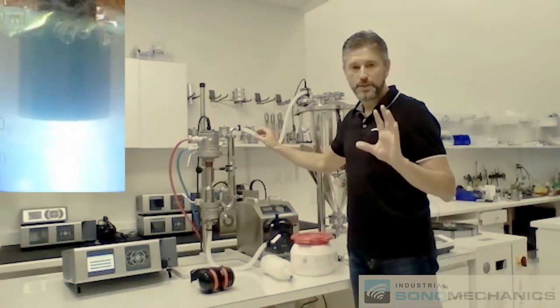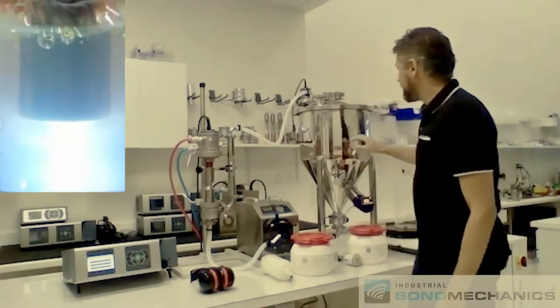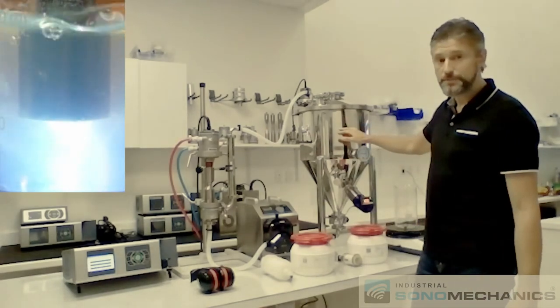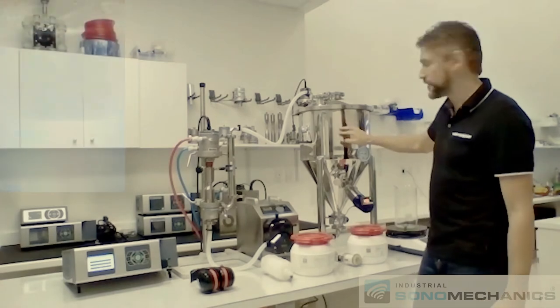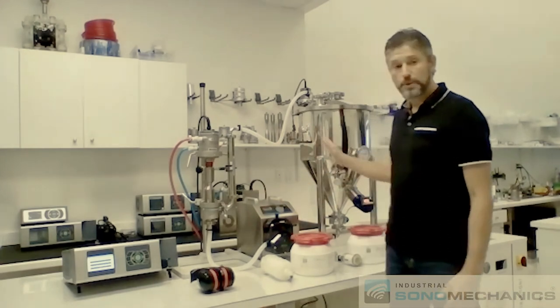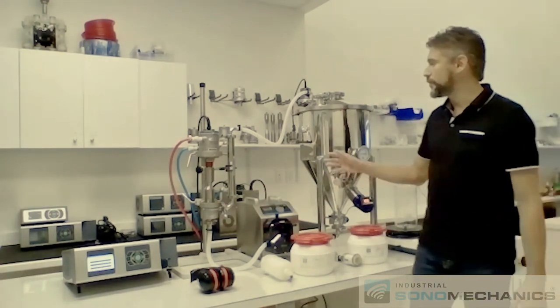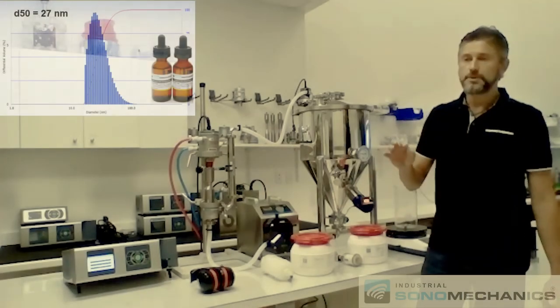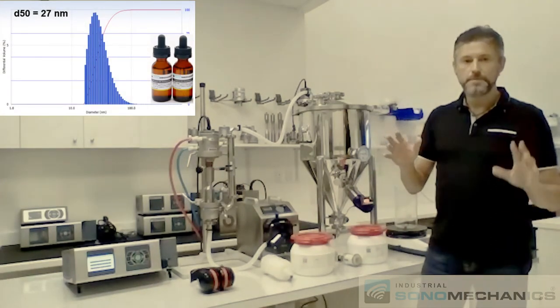that typically means that the process is done and you should expect to be able to process approximately 20 liters of nanoemulsion in one hour with the system, which is about half the tank. This is a 50 liter tank. And at the end of this process, when everything is done, you can expect a nanoemulsion with the droplet size, median droplet size of approximately 25 to 30 nanometers.